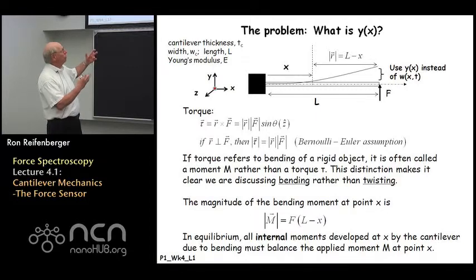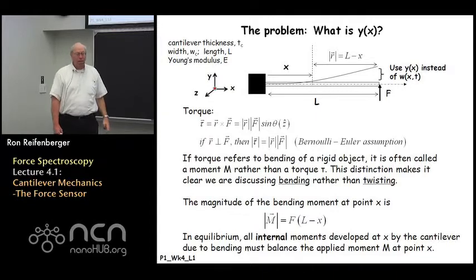But in the derivations, I find it just much more intuitive if, instead of using w of x and t in this discussion, we use x to represent the displacement along the cantilever and y to represent the displacement of the cantilever from its equilibrium position.